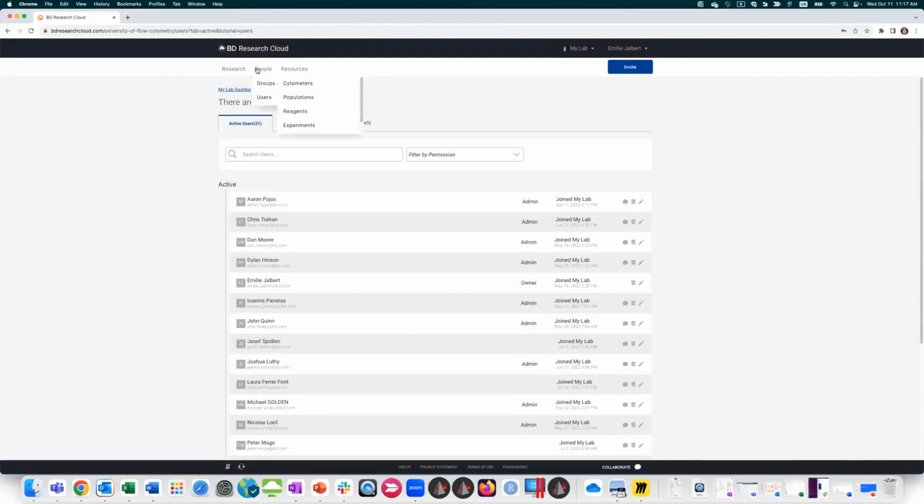All right, so now that we've created groups and projects and invited users, oh, here we go. We have a question. Does the user need to have their own account before, or is this an email to invite them? Good question. You can invite them even if they don't have an account yet.